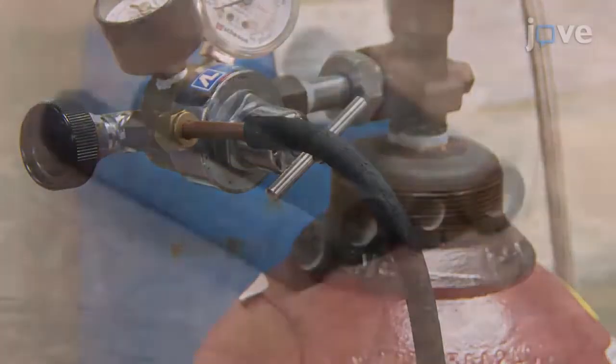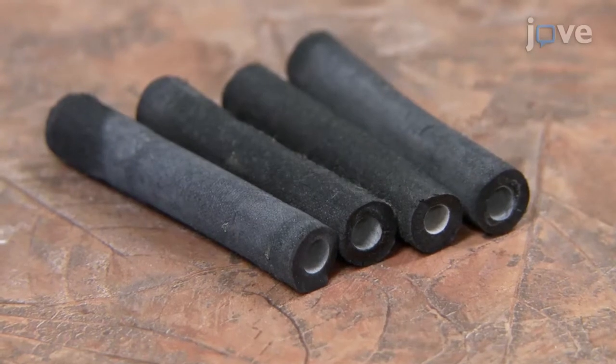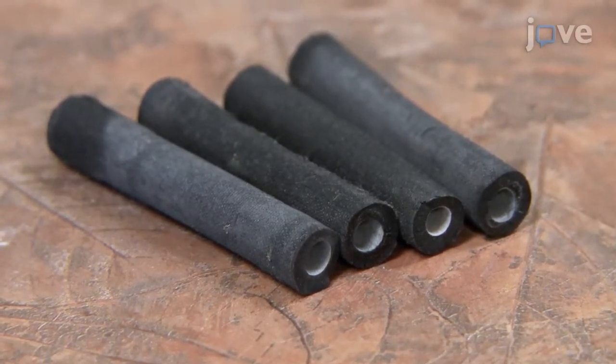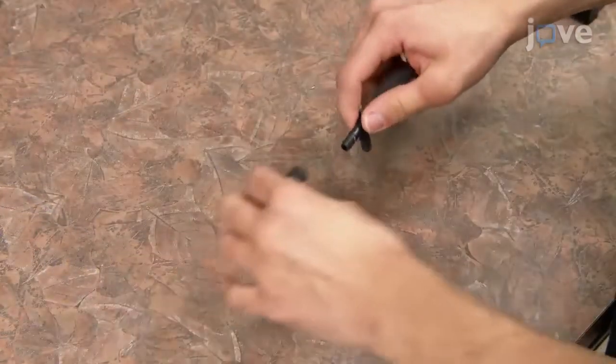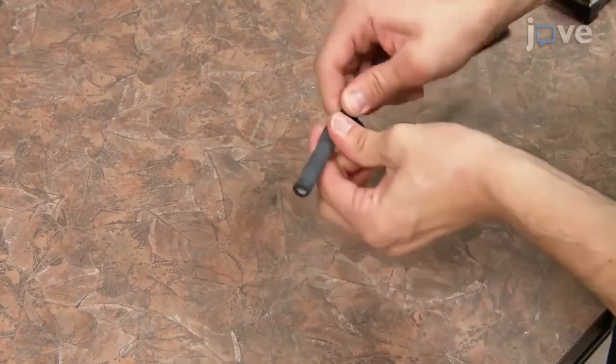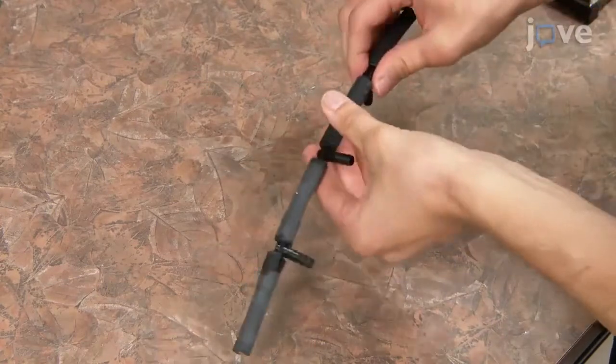To build a station capable of bubbling 5 bottles of medium at the same time, cut 4 pieces of tubing of approximately 5 centimeters in length. Assemble the pieces of tubing in a line with 3 3-way T-shaped plastic fittings.